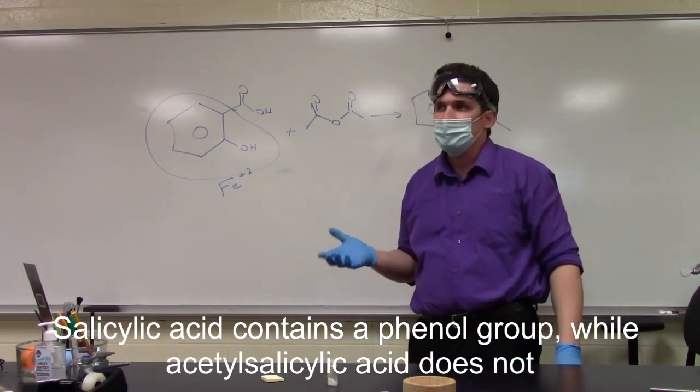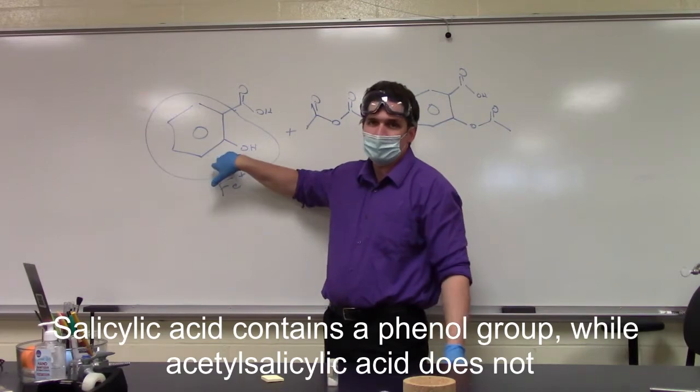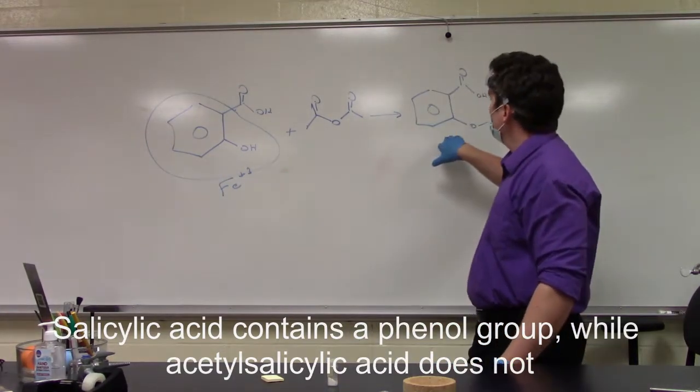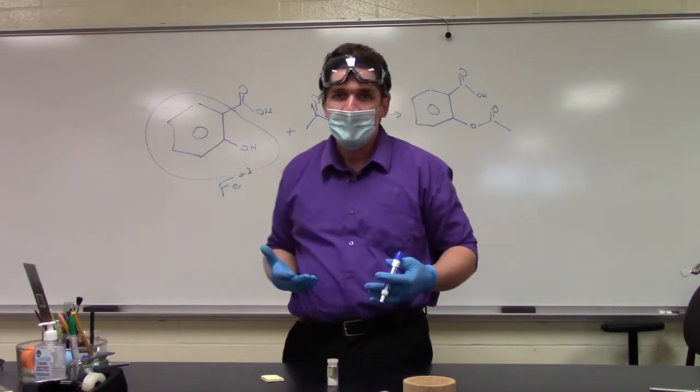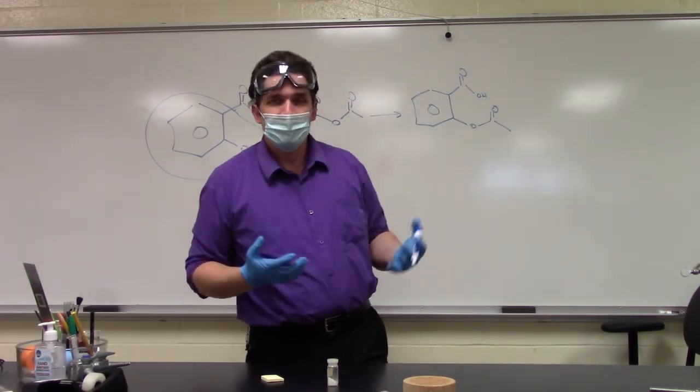And what will happen is that this iron plus 3 will coordinate with the salicylic acid, but it won't coordinate with our acetylsalicylic acid because it lacks that phenol, that OH in a benzene ring group. So this is what we're doing with the synthesis of aspirin lab.